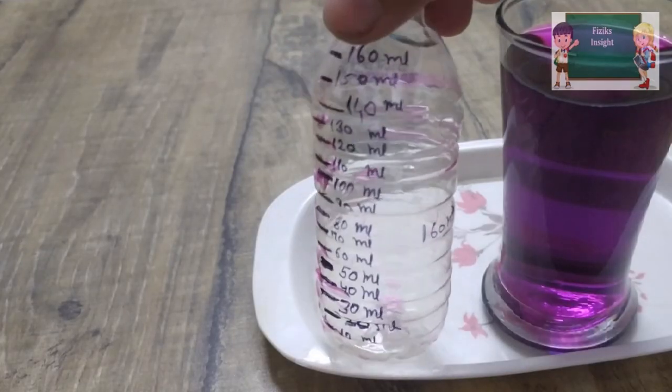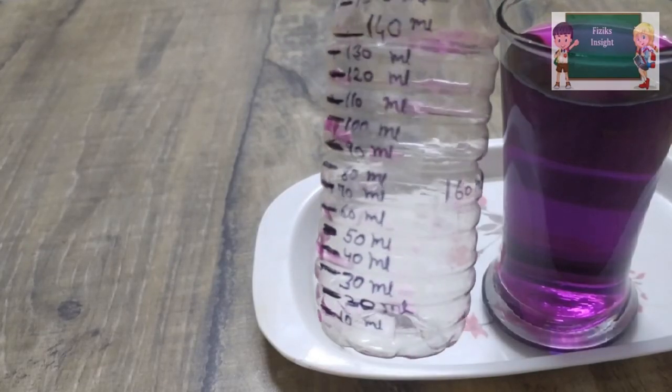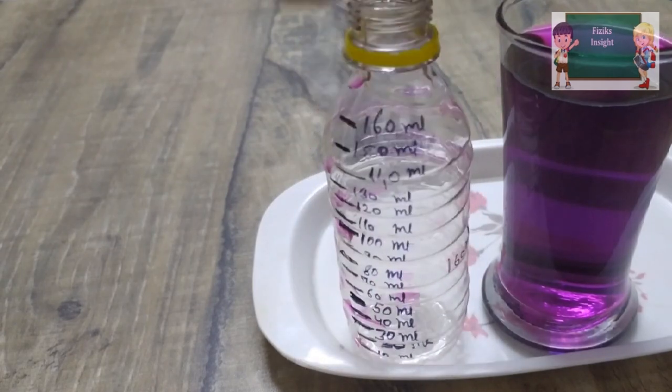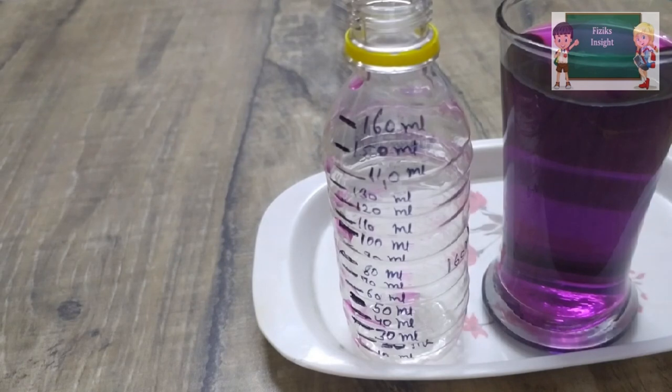Now empty this bottle. You can clearly see that we have obtained 16 graduations of 10 ml each. That's why we have obtained this cylinder of 160 ml.